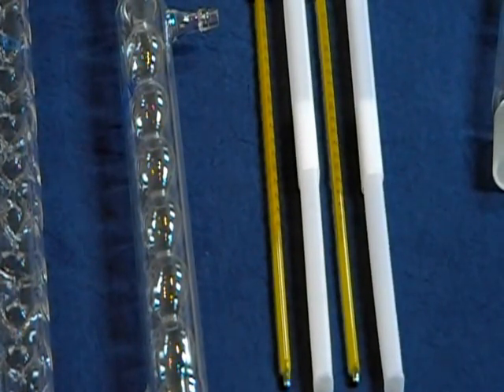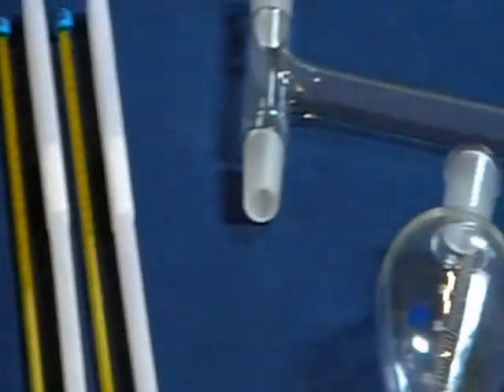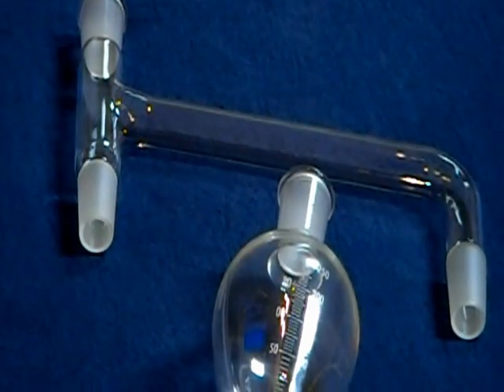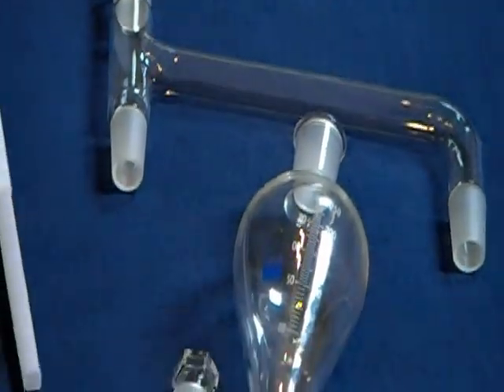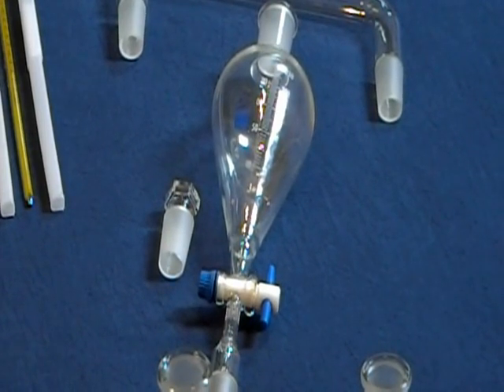Four mercury glass thermometers with plastic cases, a parallel distillation adapter, and a 250ml separatory funnel with glass stopper.